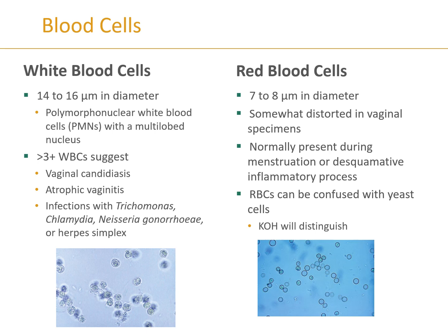But you do want to make sure that you become very familiar with distinguishing yeast from red blood cells. In my personal opinion, when you're looking at them on the microscope, the yeast have more of a greenish yellow type hue to them, whereas our red blood cells tend to have more of a brownish green tint to them.